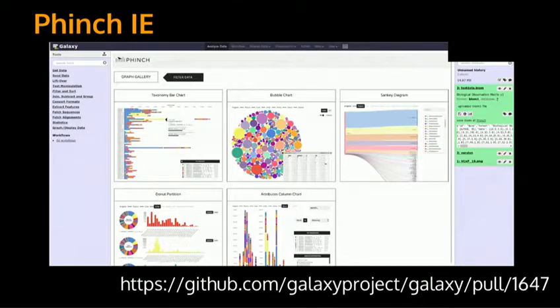She was participating last year in a workshop where we briefly introduced that as well. And she thought, okay, I'm doing metagenomics, I have this nice Finch visualization. Again, it's really complex to set up. There's a web server behind it and so on. Yeah, and she just contributed.